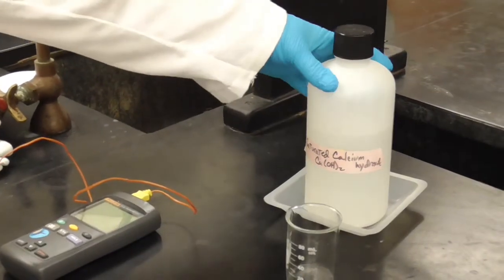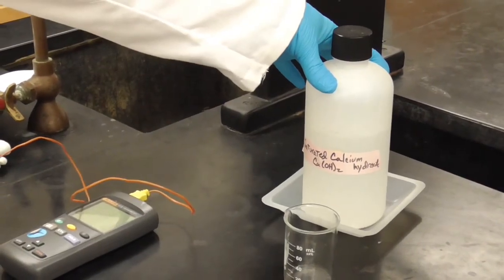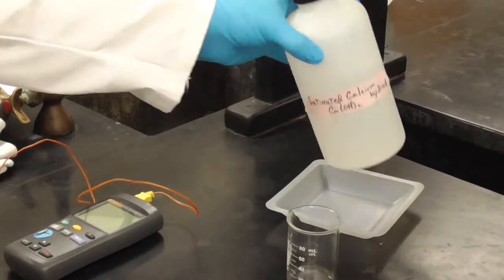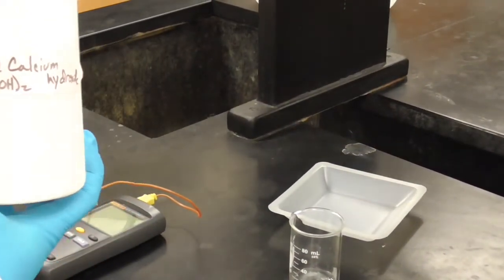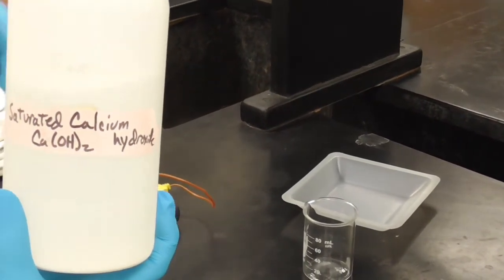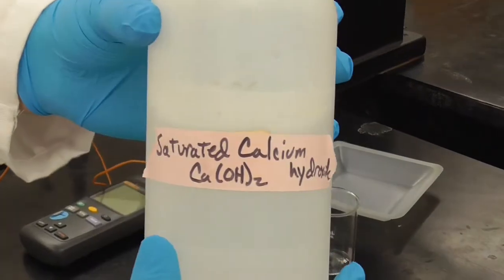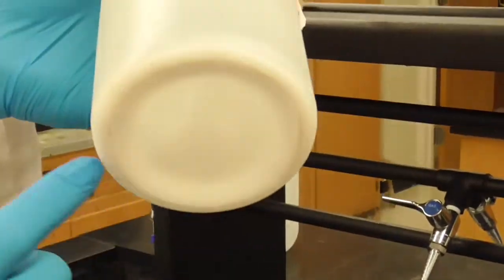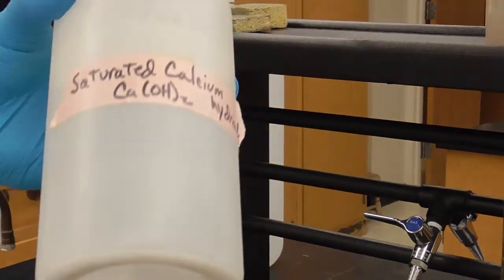Okay, so this is the solubility and thermodynamics experiment for Chemistry 1420, Gen Chem 2. Step 1 says use a clean, dry beaker to acquire 50 to 60 mL of the saturated calcium hydroxide solution. So we have that here. You may or may not be able to see there's some white solid there at the bottom.